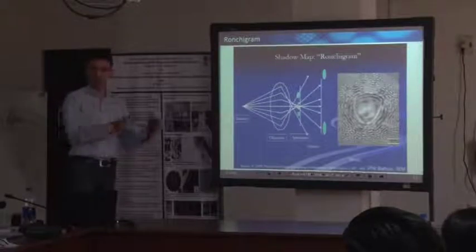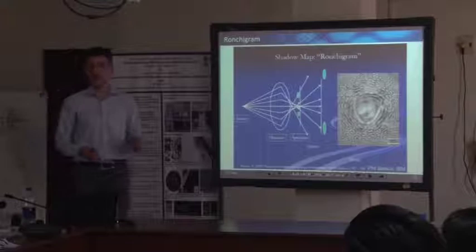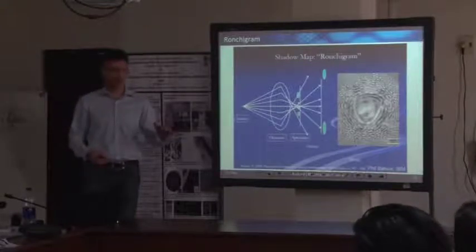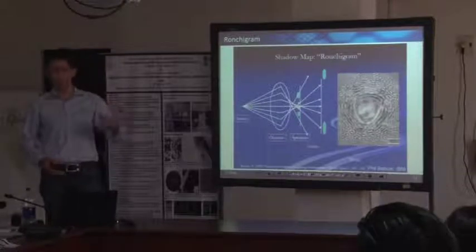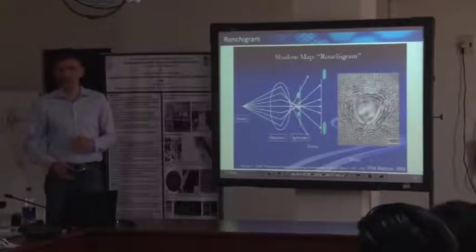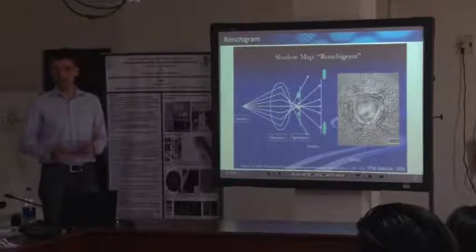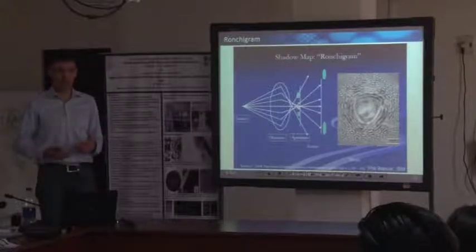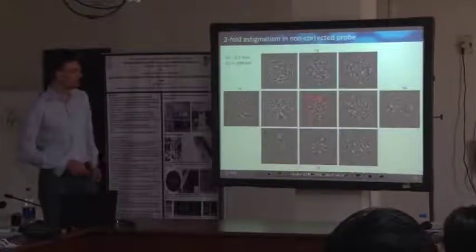And for sure, if you move the sample around, the height of your sample, then you will either have to adapt the height of the sample, or you will have to refocus onto your sample. But as long as you stay in the same area, you might need to align astigmatism if your sample slightly changes. You might need to compensate for that after a certain period of time. But in principle, this is how we align the STEM mode.